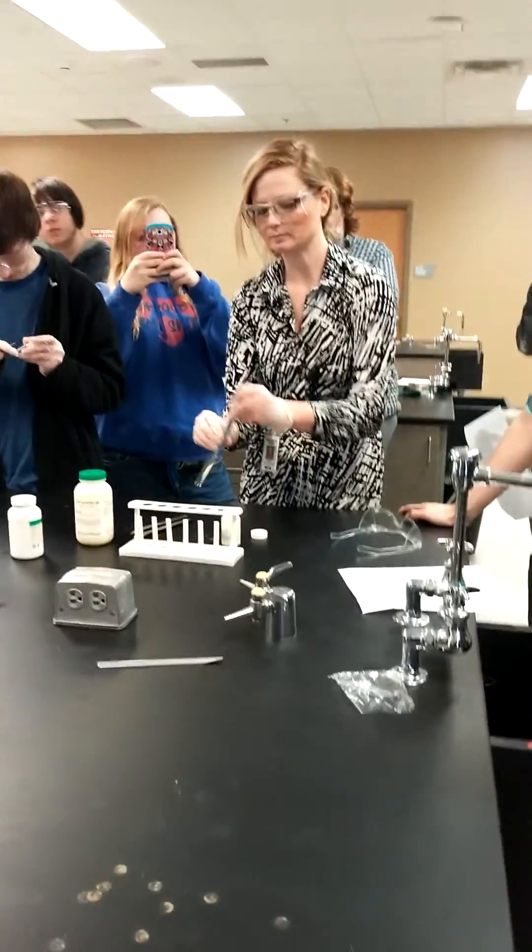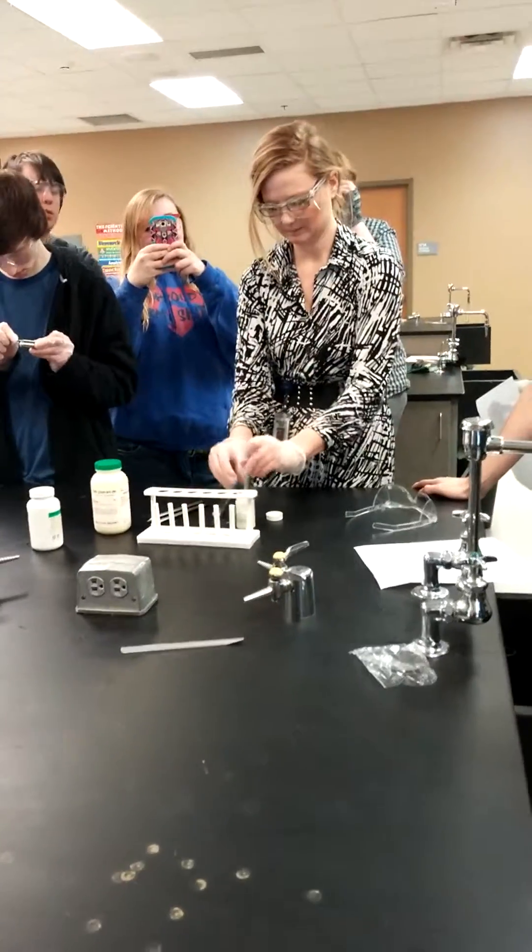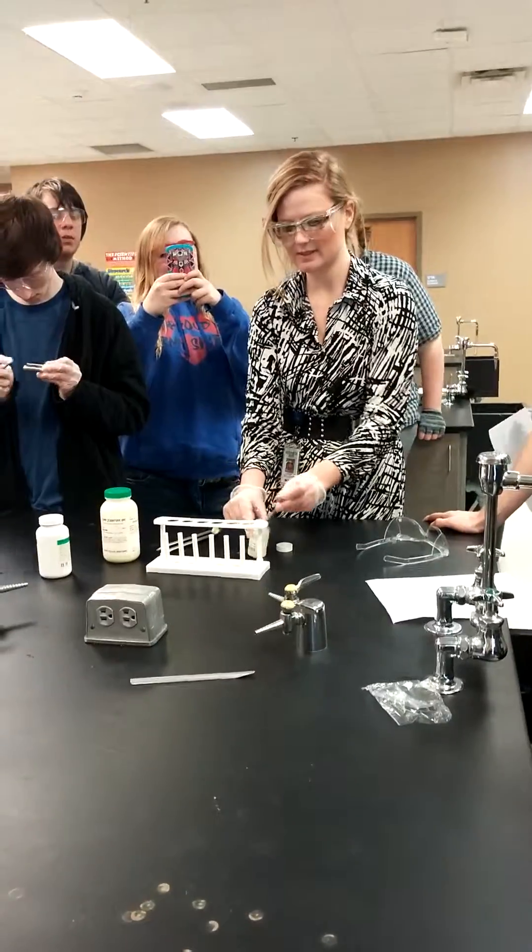Rotten eggs, okay? It looks like it too. It looks like the yolks. So is that solid? This is solid.